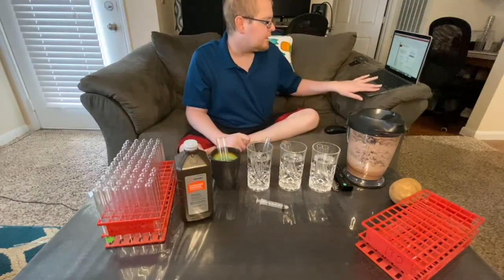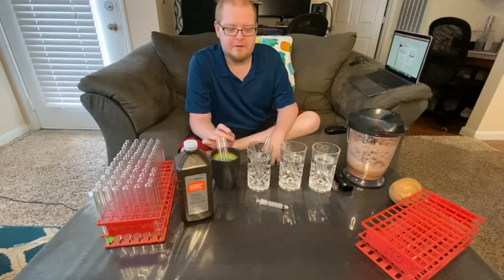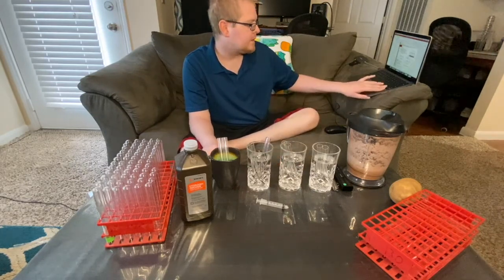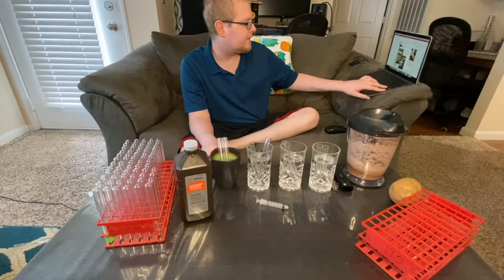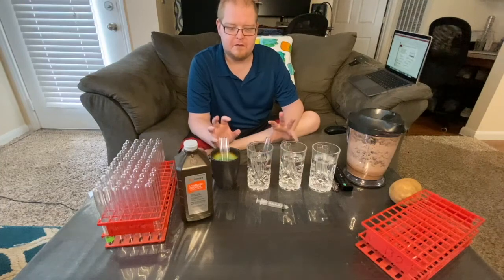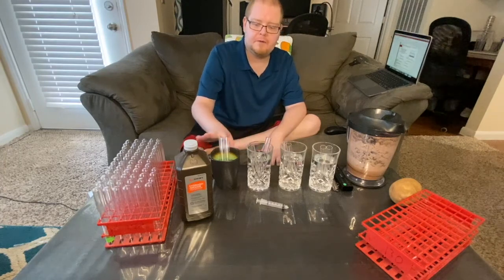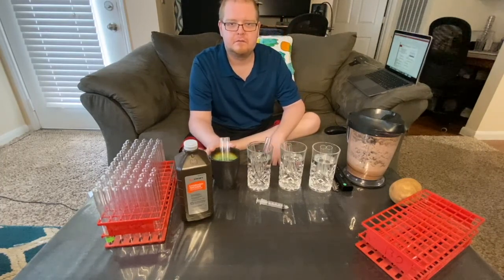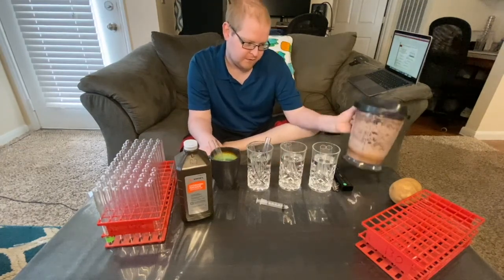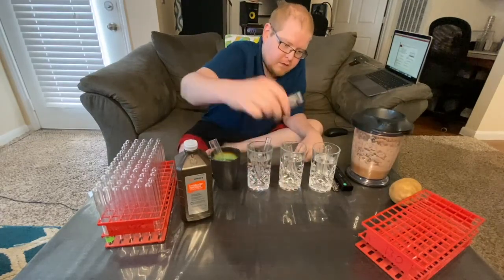Try to measure out as exactly as you can in each of your glasses. Put them into some type of bath of your water, and then you're going to put in your catalase. Let's go ahead and do some of that right now.